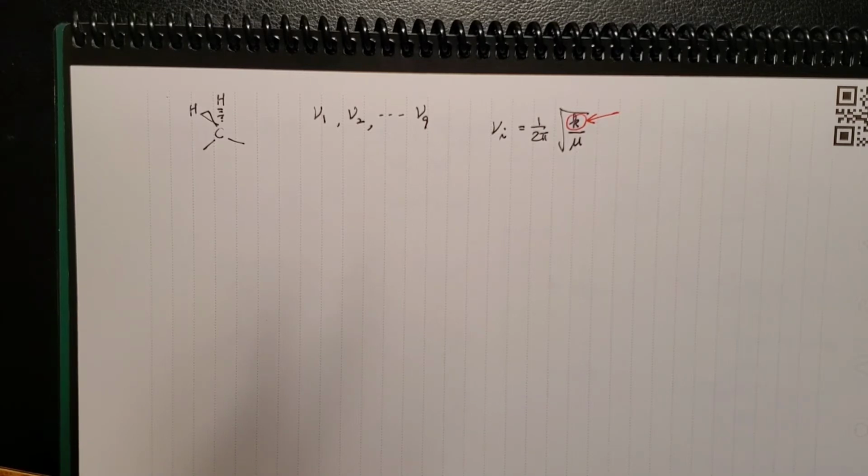Also, by measuring the intensity and applying Beer's law, you can calculate the concentration that is free and the concentration of the molecule that is bound. So you can calculate the equilibrium of the two states as well.